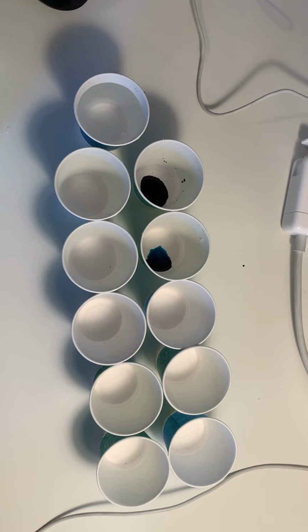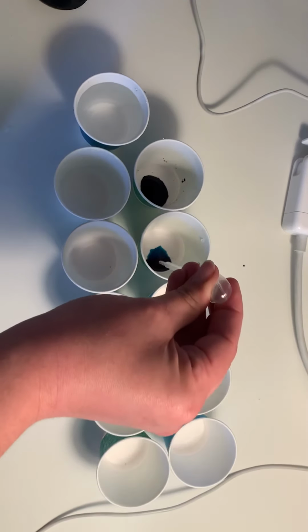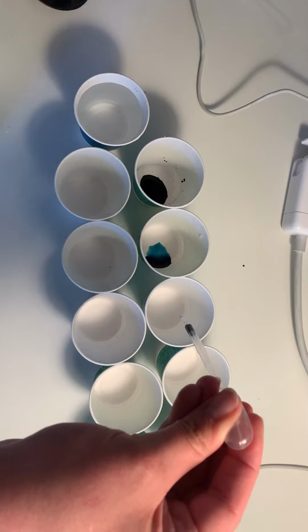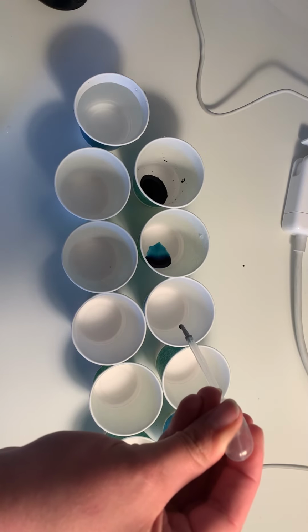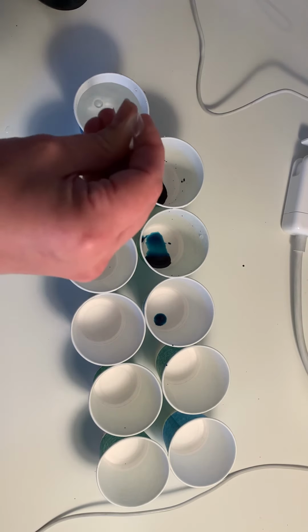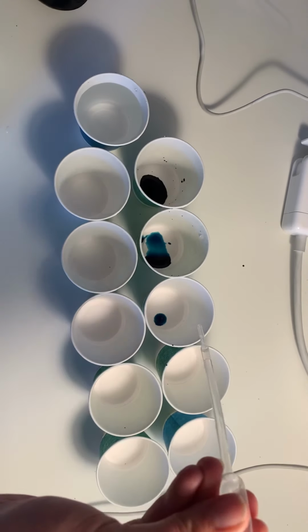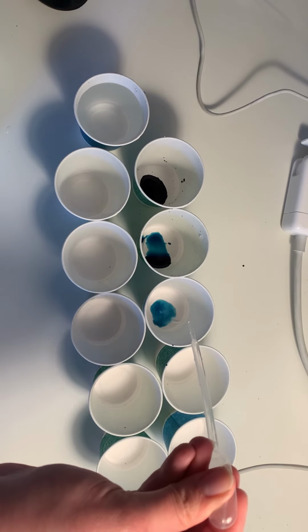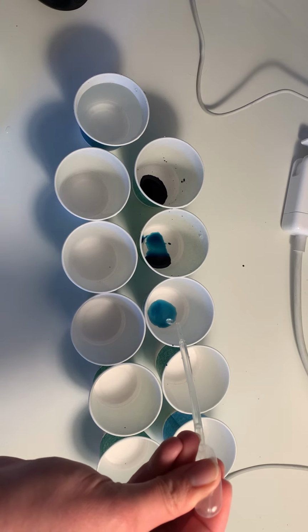Now I'm going to continue doing that over all of my solutions. So 1 drop of the coloring to 9 drops of water. 1, 2, 3, 4, 5, 6, 7, 8, 9.